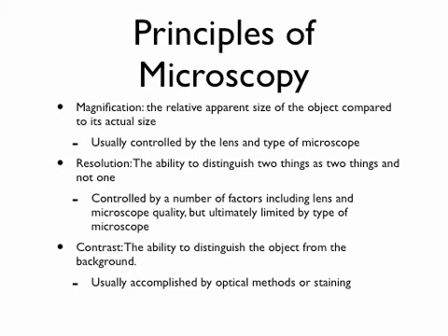So who here has seen one of your teachers give a PowerPoint presentation, and it's got a black background and dark blue text? Or it's got a white background and yellow text, and you look at it and you go, the heck? Does that say something? What made that person think that was a good idea? That's contrast. That's poor contrast.